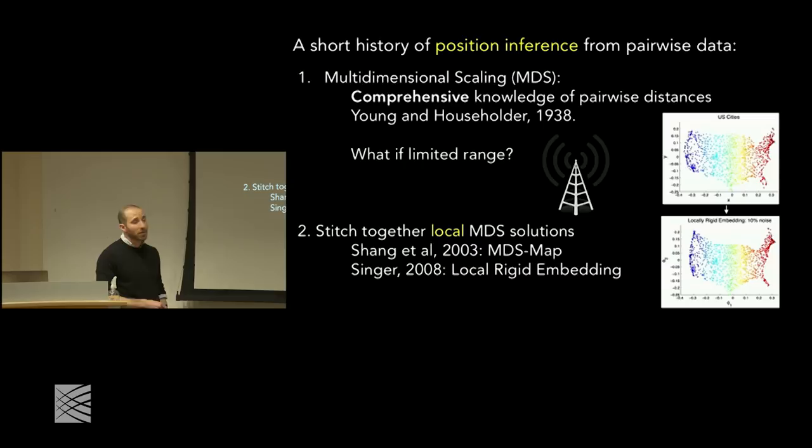And the basic mechanism by which you achieve this is by basically performing the previous method, multidimensional scaling, on local domains and basically stitching those solutions together.